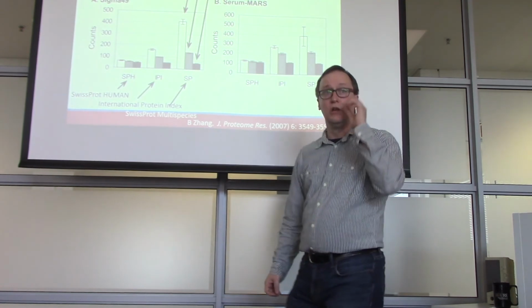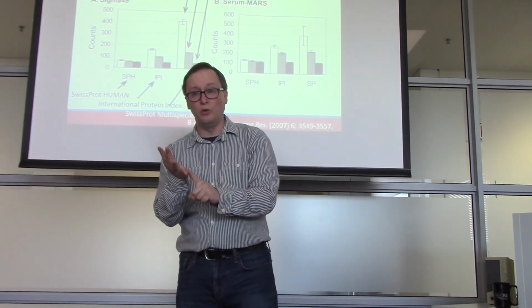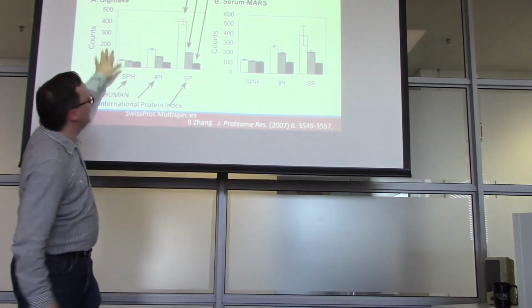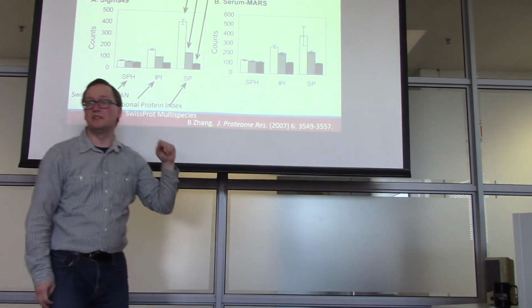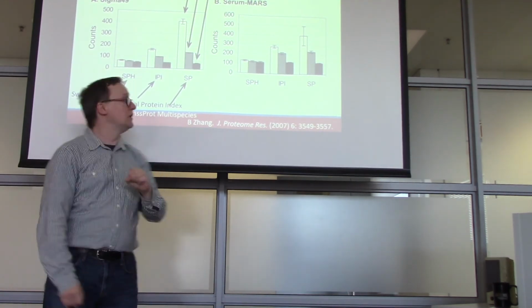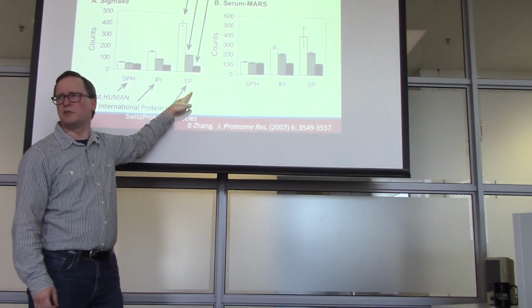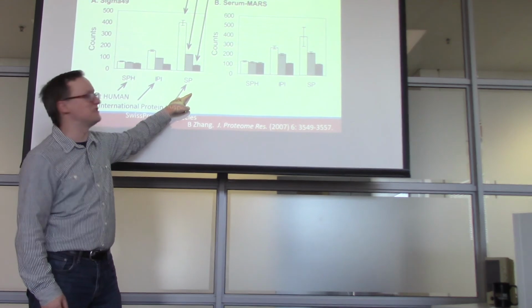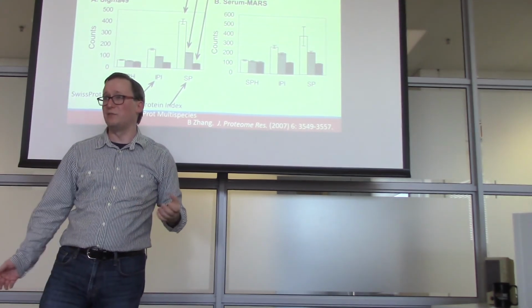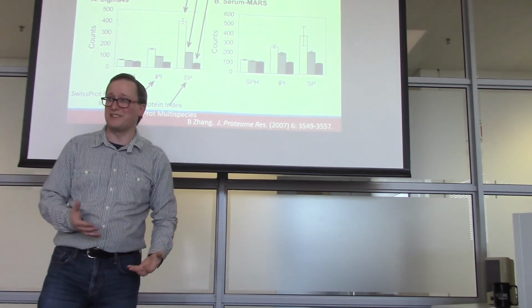In total, we do quite a lot by applying these indiscernible rules and parsimony rules. In this case, we have a protein sample that contains 49 proteins from humans. We know they're from humans. When we search it against SwissProt, which at the time I think had about 250,000 different protein sequences in it, we got more than 400 proteins identified from these data. 400 proteins identified when only 49 were present.